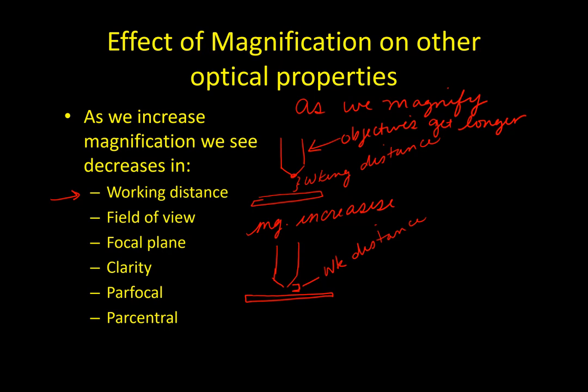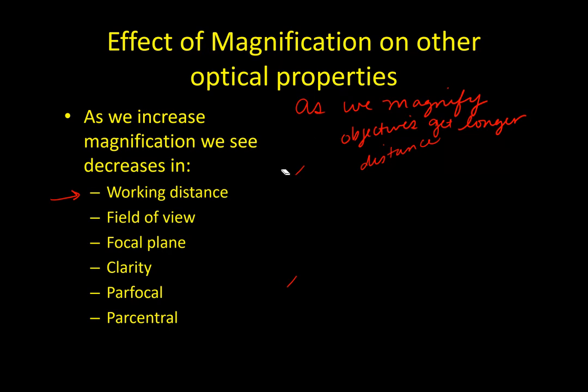The more I magnify, the closer that objective lens gets to the slide. So my working distance gets smaller.